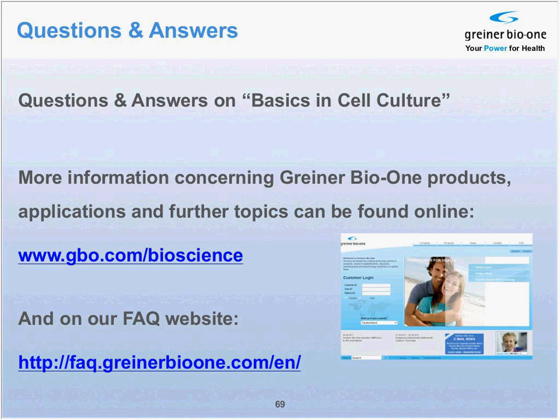And now I guess they are at the age of 25 years, so definitely cells could be stored in liquid nitrogen for an unlimited time. But the question, I guess, was about minus 80 degrees. Is that right, Mackenzie? Mm-hmm.